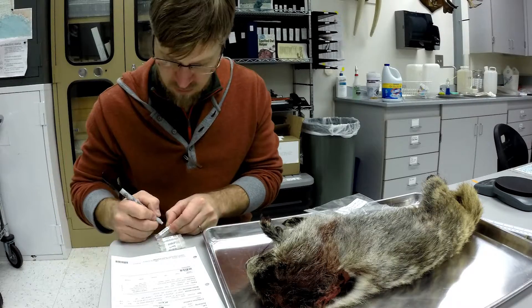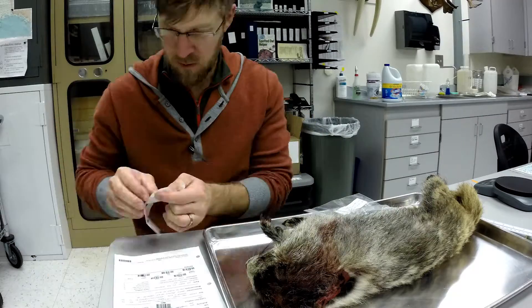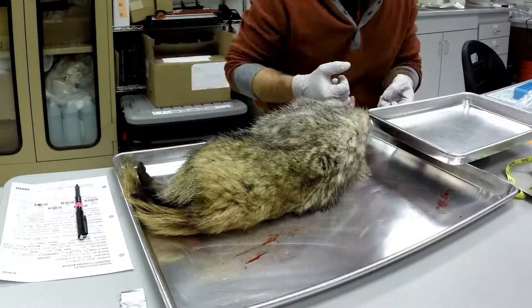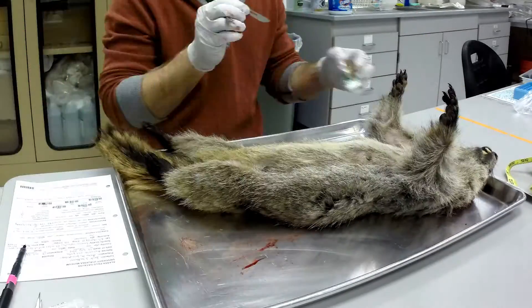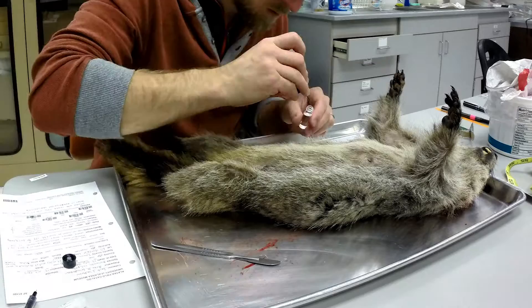Here I'll be preparing a hoary marmot specimen. This marmot was collected from the White Mountains just north of Fairbanks. We begin the process of preparing a museum specimen by recording the data about the specimen onto a standardized form to make it ready for data entry into our specimen database.